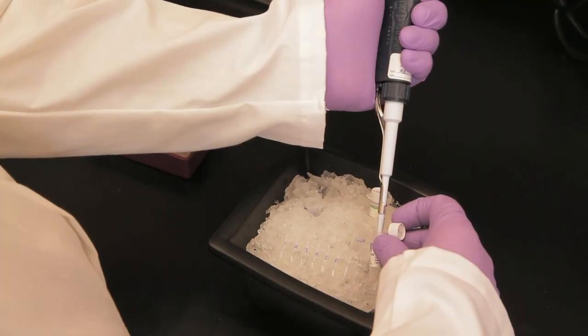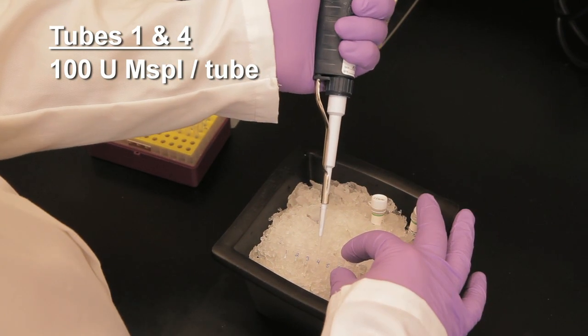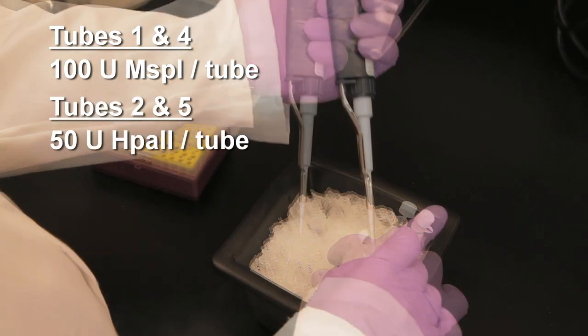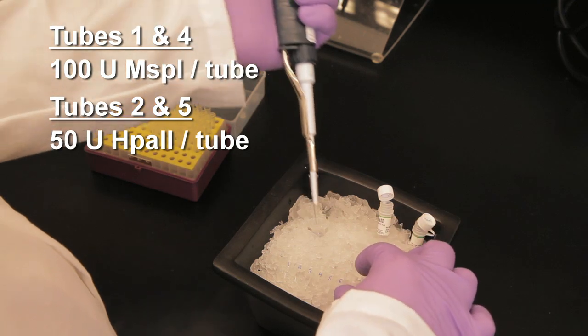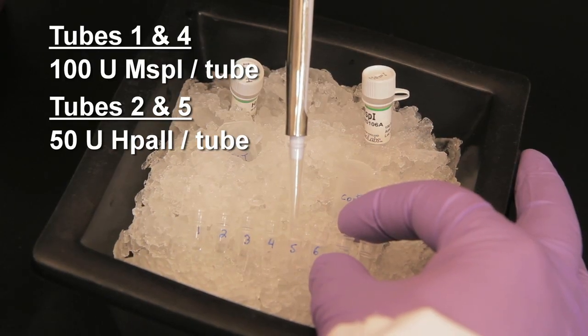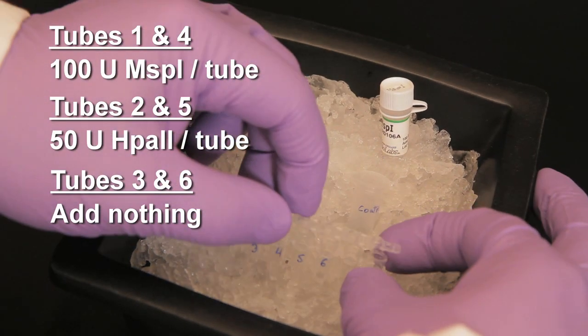Add 100 units of MSP1 into tubes 1 and 4. Next add 50 units of HPA2 into tubes 2 and 5, and mix well by gently pipetting up and down. Do not add anything to tubes 3 and 6 as they are controls.